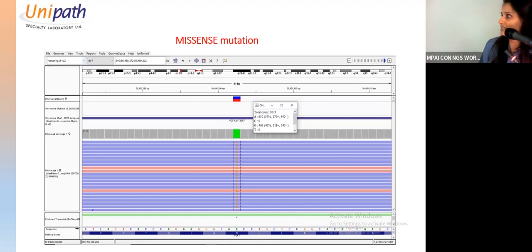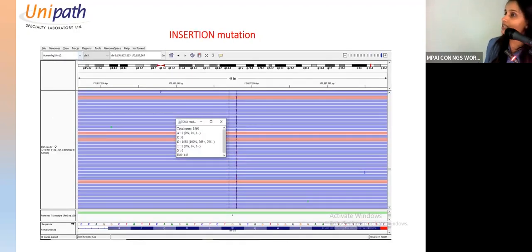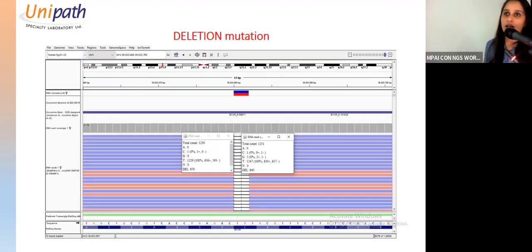It looks like this. Now you have insertion. Insertion, you get it in this form. This is the symbol of the bases that gives you the insertion. See here, you can see the number of insertions. So this one is the reads. This one is the gene which is the reference, and the number of times. This is the reads representing insertion. Now deletion.